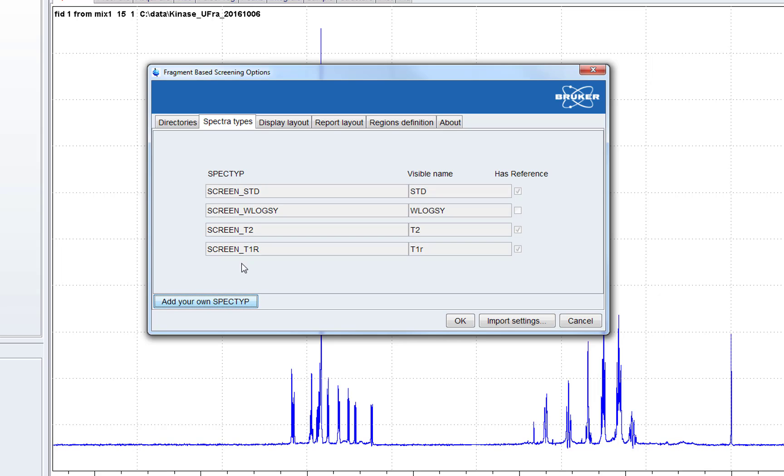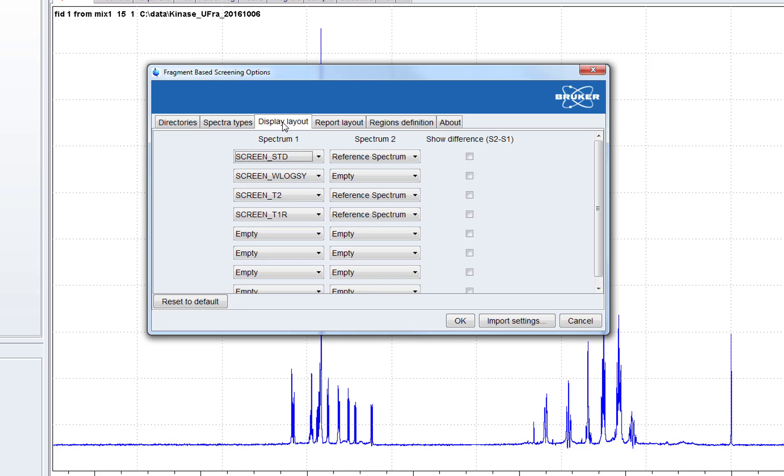Here we can choose the spec types, we can add our own. This is the display layout which spectra should appear in the display.